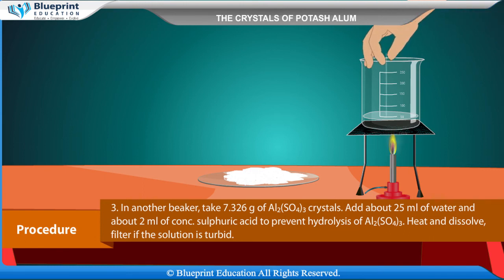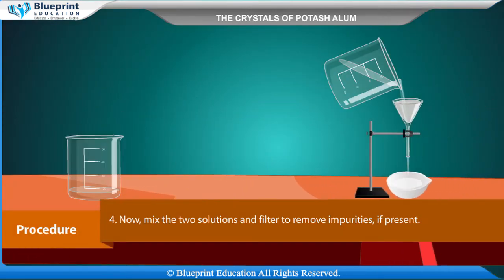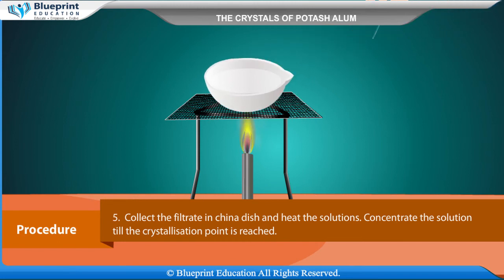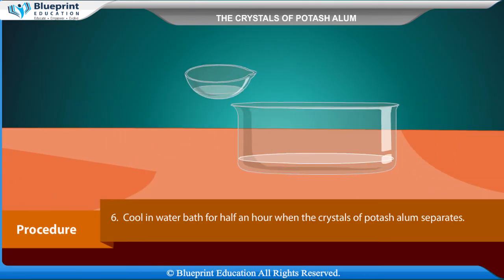Heat and dissolve; filter if the solution is turbid. Now mix the two solutions and filter to remove any impurities present. Collect the filtrate in a china dish and heat the solution. Concentrate the solution till the crystallization point is reached. Cool in a water bath for half an hour, when the crystals of potash alum will separate.